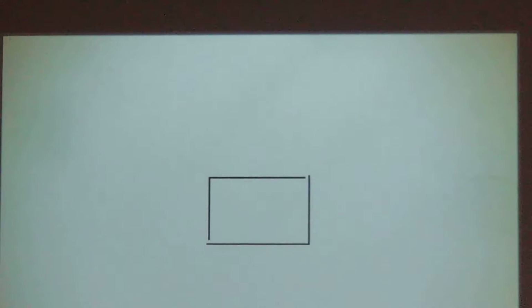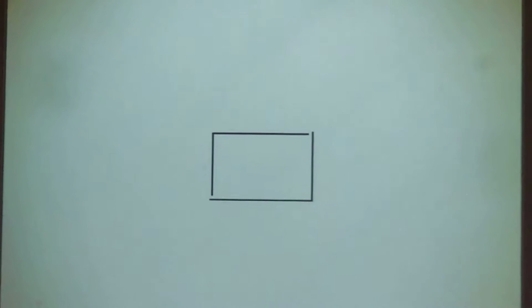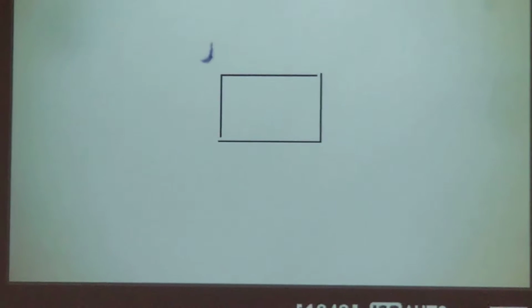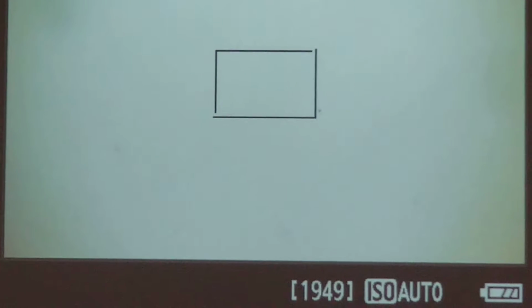Third slide, dense regular connective tissue, slide 20. You can't go by the title because this is a slide of tendon. So this is what tendon looks like, and this can be very pale, very faint. If you look at it, find it, it's so pale.